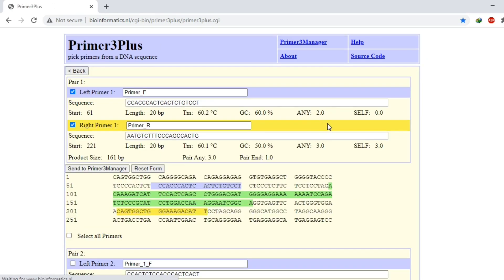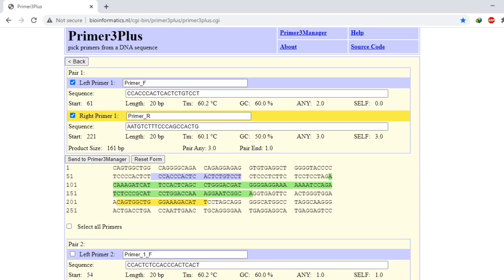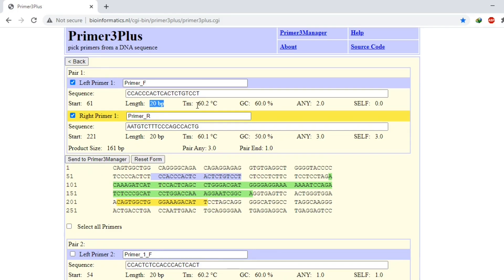Okay, so here are our primers. This one is our first left primer and its melting temperature is 60.2. And as I have already told you, the melting temperature should be between 55 to 65, so its melting temperature is good. GC content is also good.